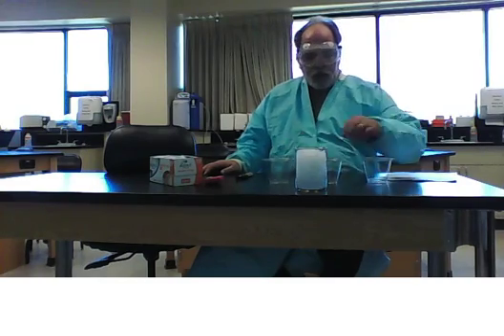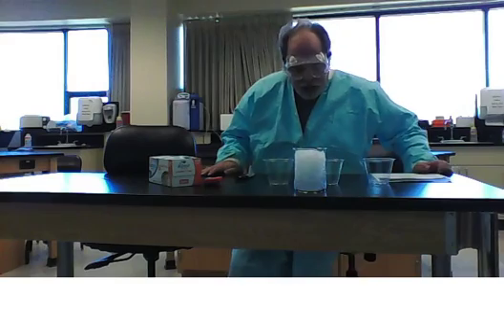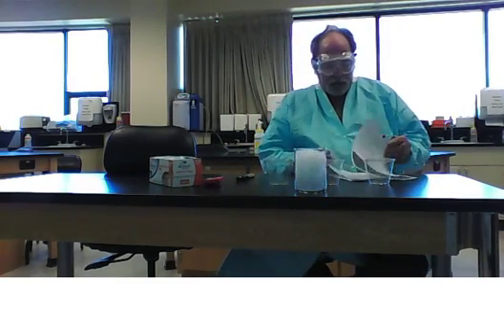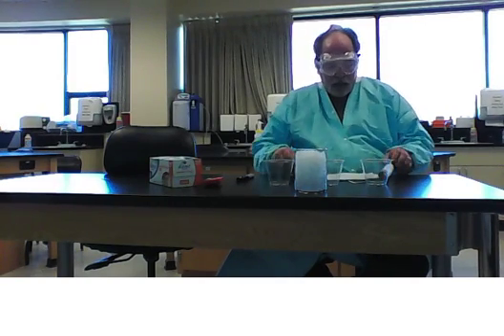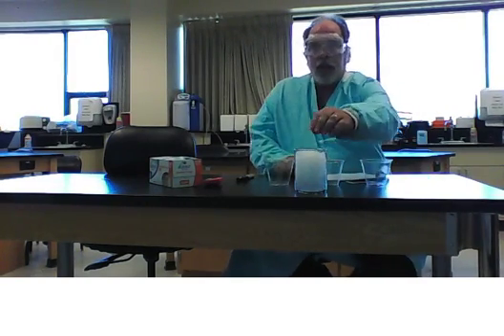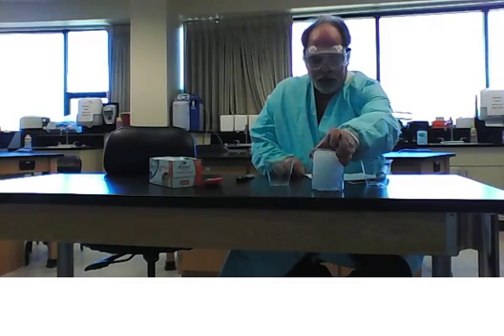This podcast will deal with the procedures involved in the homeostasis lab. Relatively simple experimental setup here. What you're going to need are ice cubes. I've got some crushed ice here.